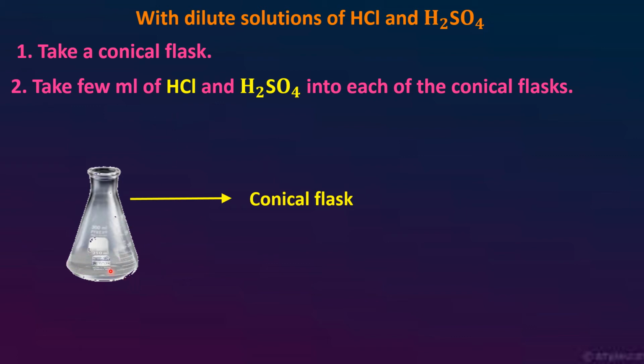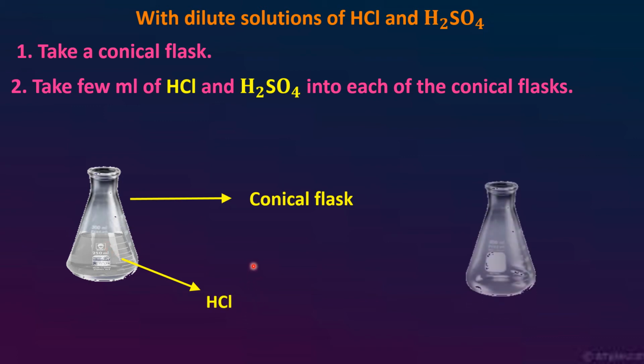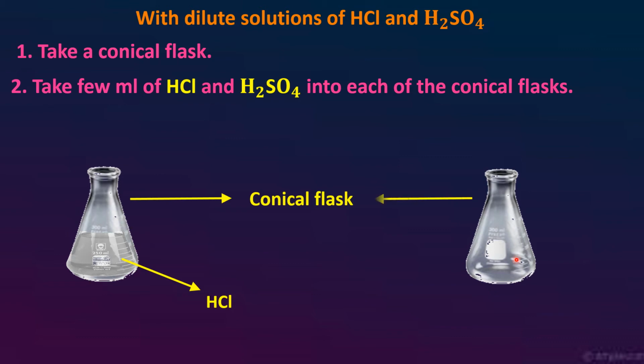See, here we are taking HCl. This is dilute HCl. And in the other conical flask, we'll take dilute H2SO4. Yes, here I am taking dilute H2SO4.